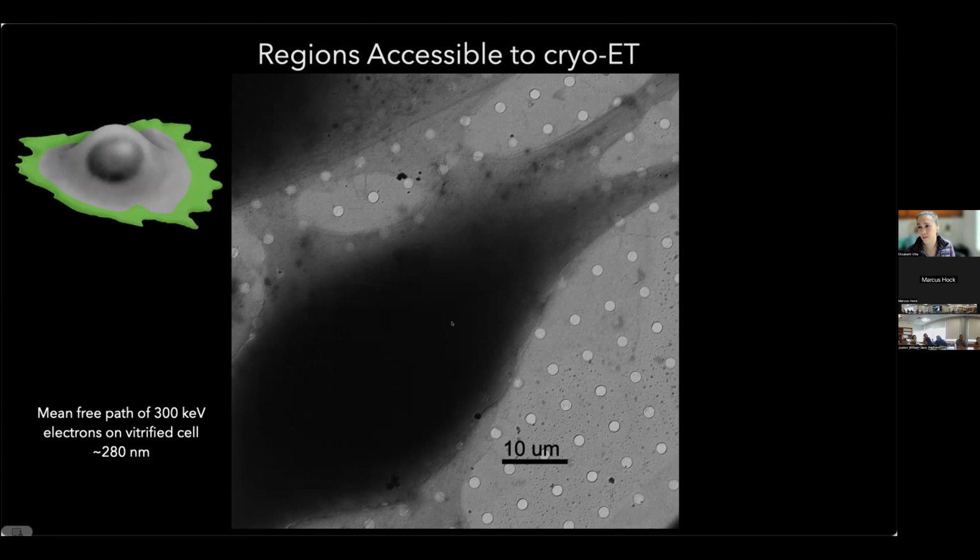So for a long time with cryo-ET, we couldn't really do a lot of interesting things. We were looking at isolated mitochondria or just the edges of cells, which are very interesting in themselves, or even very artificially skinny bacterial cells. So it was really not the thing.